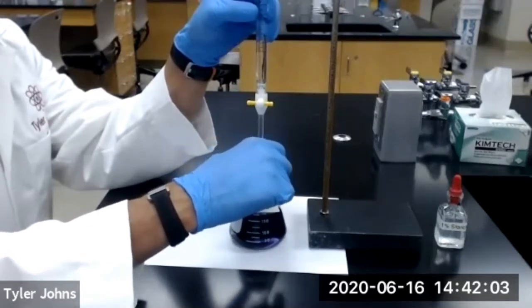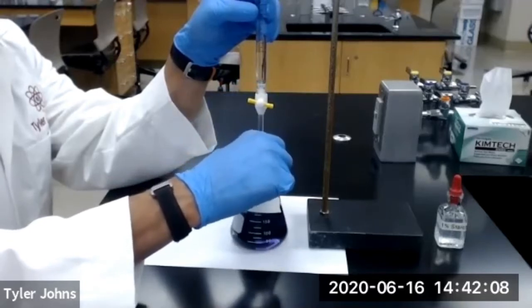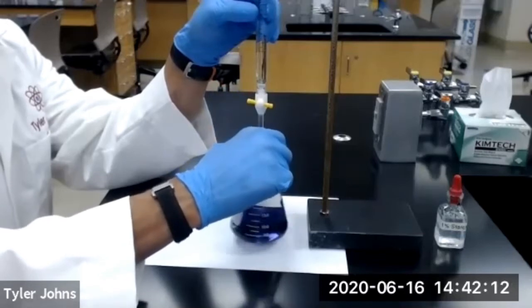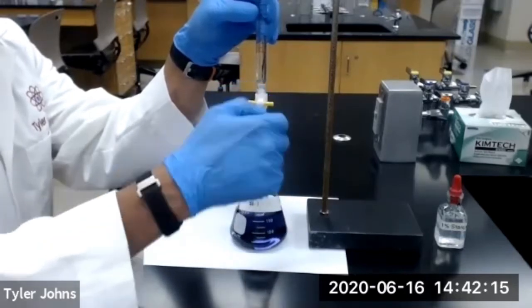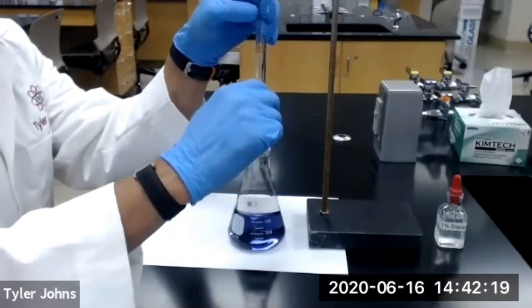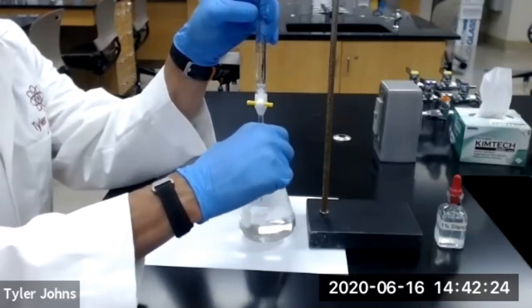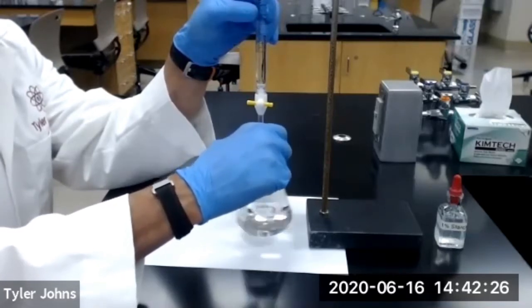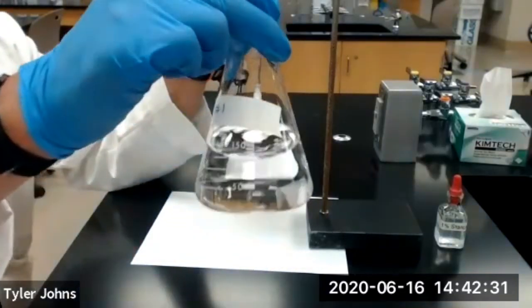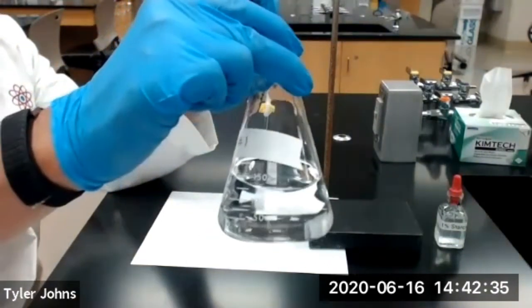We are nearing the endpoint of our titration. You can see that our solution has just become clear. That is the endpoint of this titration.